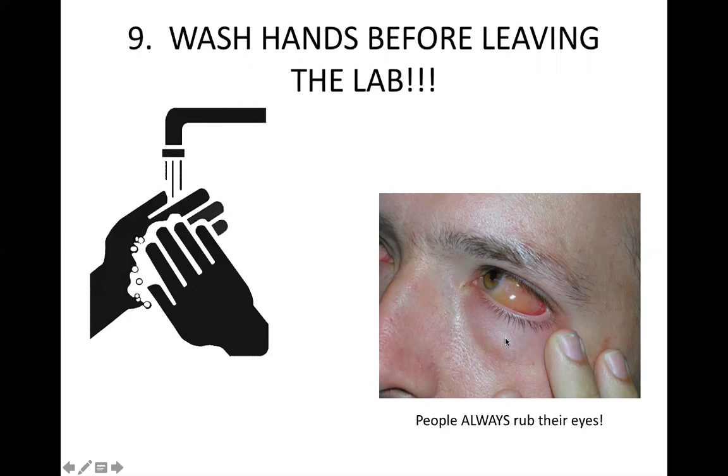So in the picture here, someone rubbed their eyes, but unfortunately, there are leftover chemicals on their fingers, so it can cause damage to their eyes. So if you can see here, the eyes are red because it's reacting with the leftover chemicals. And especially now in this kind of new normal that we're having, washing hands frequently is actually advisable, not just to prevent chemicals from spreading to your skin, but also to prevent the virus from spreading into your body.